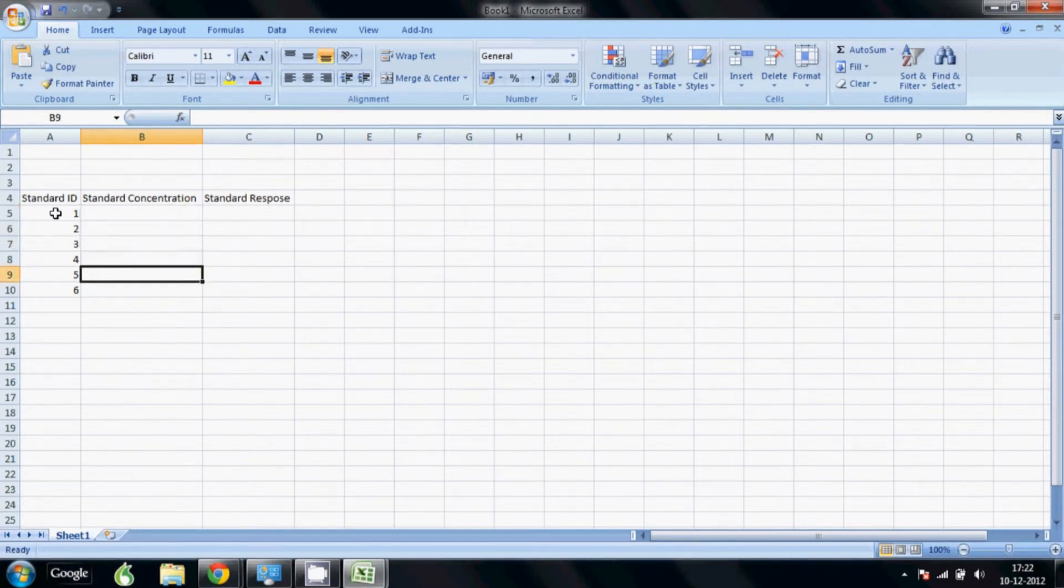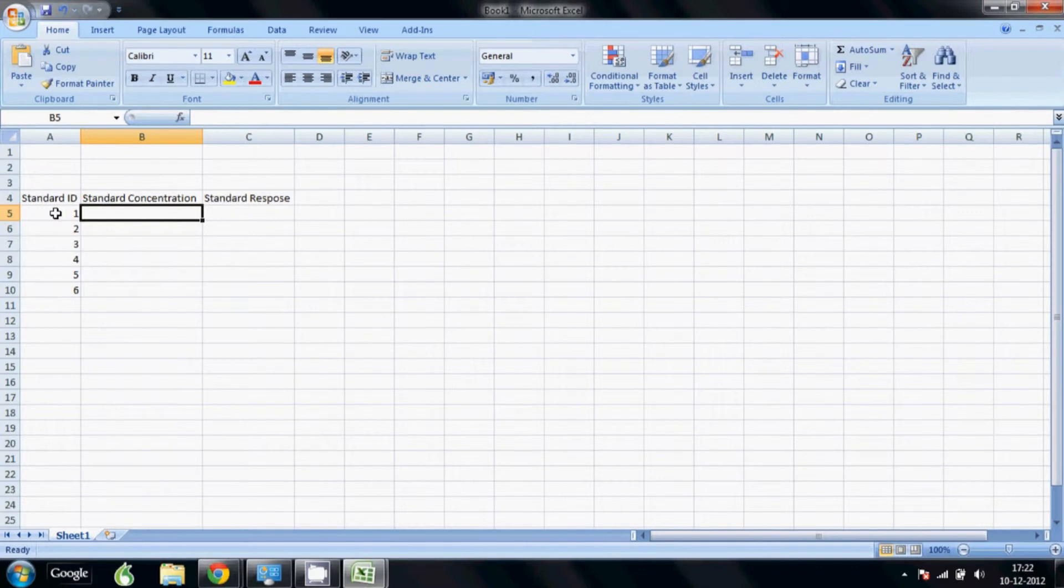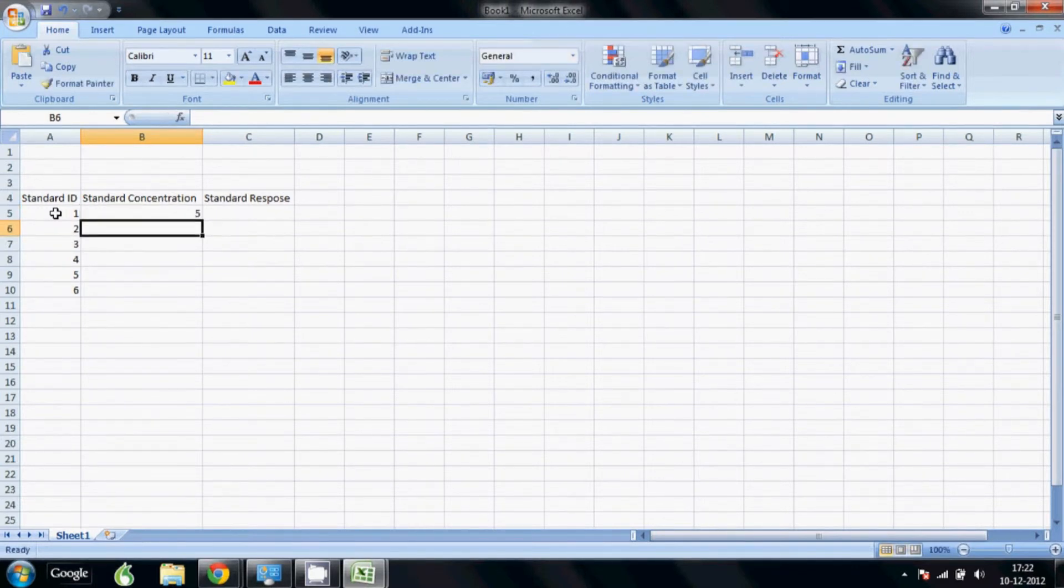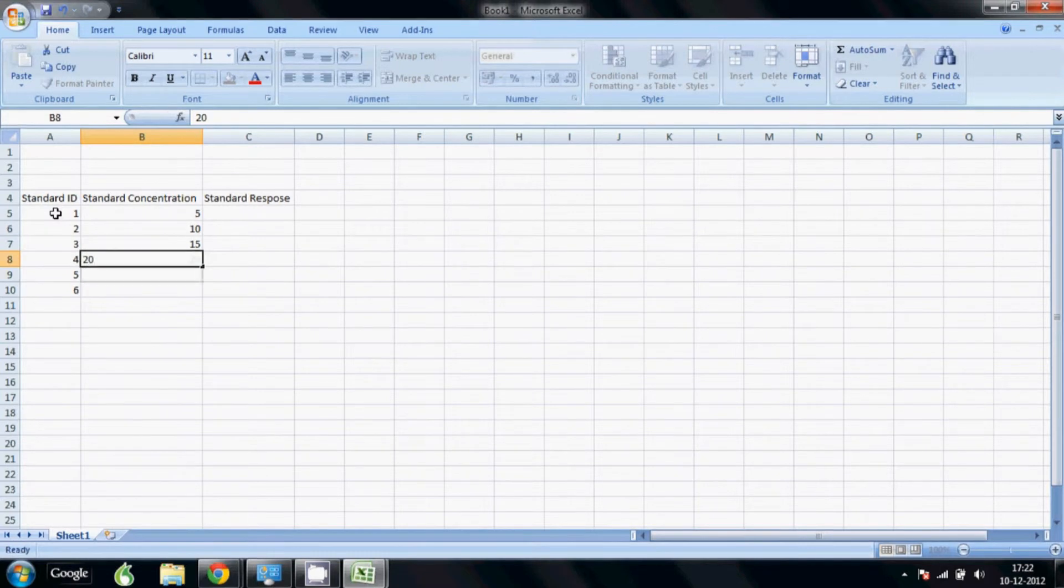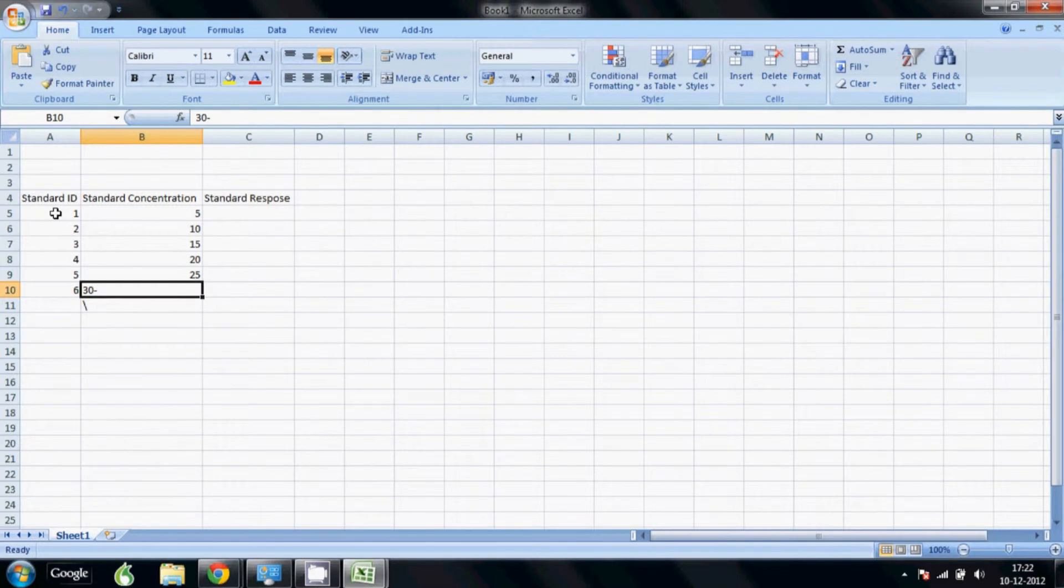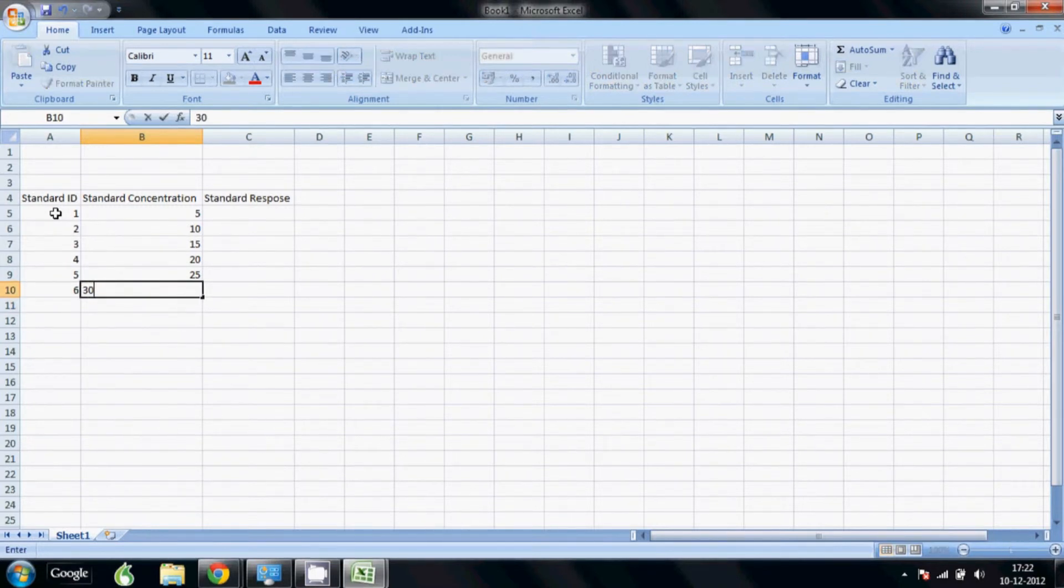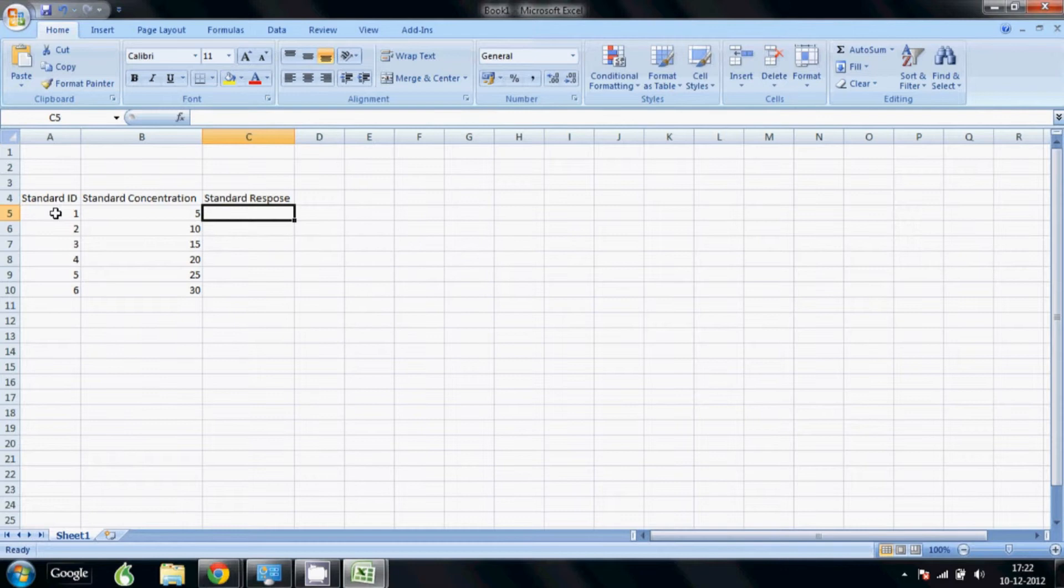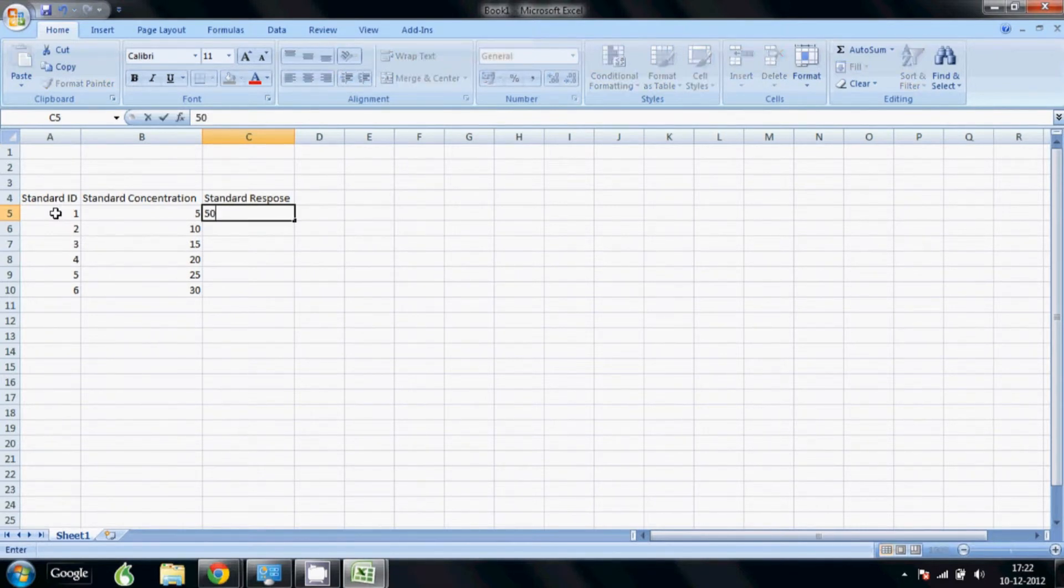And we will just put some dummy concentrations. Again, the units you will have to decide based on whatever method you are using. It is good to put some dummy data as it will make it easy for you to see that the calculations are correct. We are going to have a simple linear relationship so I am just going to make it 10 times the response.